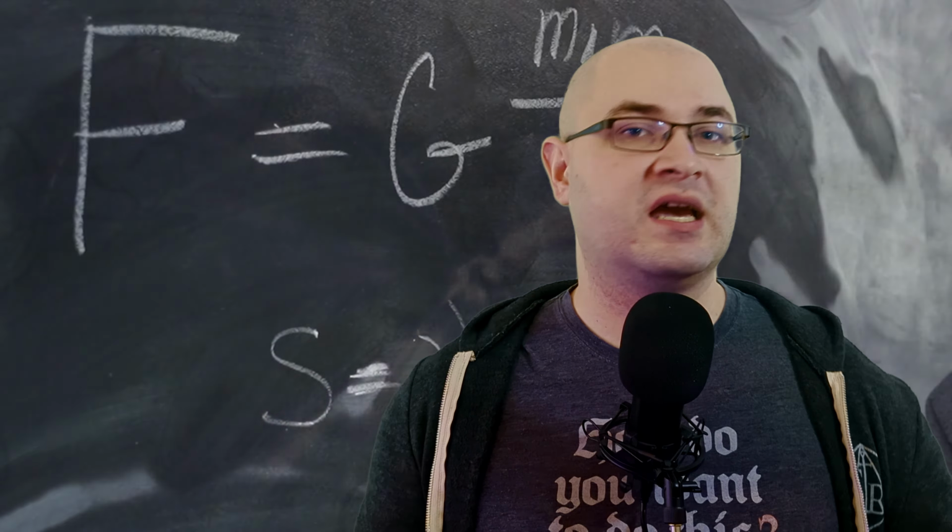Their great breakthrough was in developing the mathematical framework to translate those wiggles from abstract data into physical reality. They developed what is now known as the XAFS equation, a powerful formula that connects the oscillations in the data to the local structure around the absorbing atom. This equation allows scientists to translate the world of those wiggles into atomic structure.